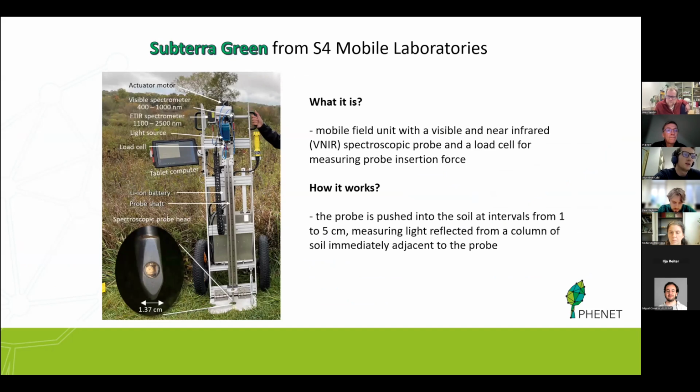Nowadays, an increasing amount of research is focusing on applying these kinds of methods on large soil databases observed in situ. One of PHENET's main goals is to bring in innovative, automatable techniques, such as the Subterra from S4 mobile laboratories. This is a mobile field unit carrying a visible and a near-infrared spectrometer and a load cell for measuring probe insertion force. It goes down into the soil, centimeter by centimeter, measuring the light reflected from a column of soil adjacent to the probe.